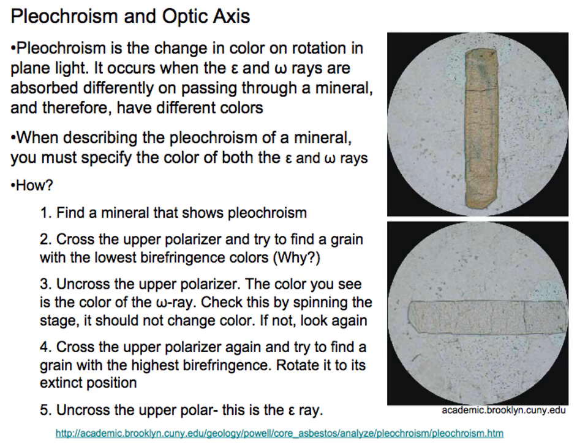And in fact, you could go back and do that fast or slow ray method with the accessory plate and determine if the mineral is uniaxial positive or negative. And in the back of optics texts, there are charts that list uniaxial positive and negative minerals, and with these other properties like maximum birefringence, the amount of relief you see in plain polarized light, any cleavage you observe, and color or tint, you can probably definitively identify the mineral now.